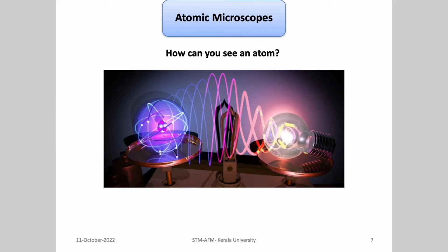That's where we have to look and see. I mean, our idea is not to see atoms. That is an ultimate microscopy technique, to see an atom. More than an atom we cannot see. Okay, because electrons, we cannot really see electrons. We can only see electron clouds. Okay, that's what we actually see from scanning tunneling microscope. So if you want to really see an atom, we have only two ways, right?